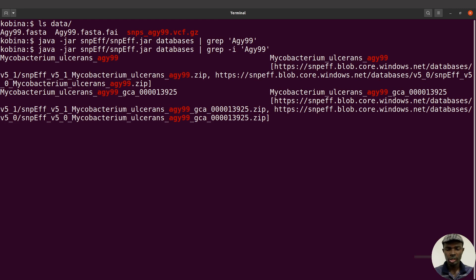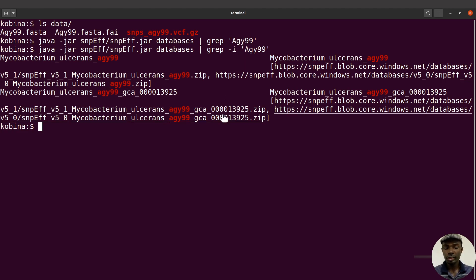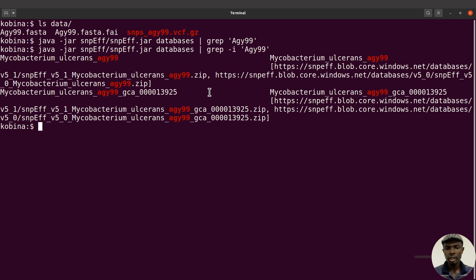Once I do that, you will see some results coming up. You can see what has been displayed — here we have AGY99. This means the names in the database do not start with uppercase; it starts with lowercase AGY99. That's why the -i flag is handy — it helped us streamline things. This means that SnpEff has information for our reference sequence; the databases contain information for AGY99.